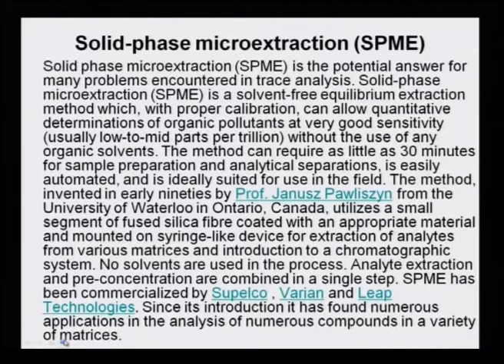Solid phase microextraction is a solvent-free equilibrium extraction method which, with proper calibration, can allow quantitative determinations of organic pollutants at very good sensitivity. Usually low to mid parts per trillion can be separated without the use of any organic solvent. Parts per trillion means ppt.